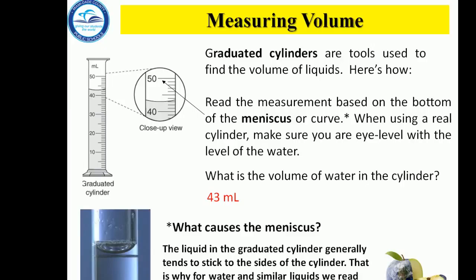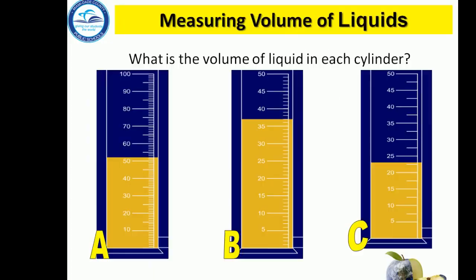Now, what causes the meniscus? It's actually, believe it or not, liquid is kind of sticky, and so it sticks to the side of the cylinder, and that's why we read the bottom of the meniscus, not the top.